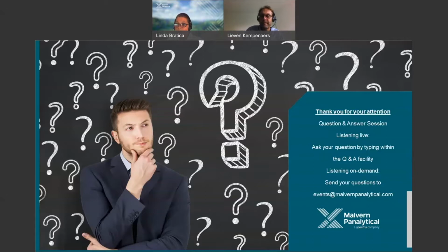Thank you. And I hope now I will pronounce it correctly. With XRF, is the LOQ for a given element impacted by the sample matrix, for example, in dextrose versus in sodium phosphate? Yes, sort of, yes. So the LOQ will be different when you have a different matrix, in this case dextrose or sodium phosphate, it's slightly different.